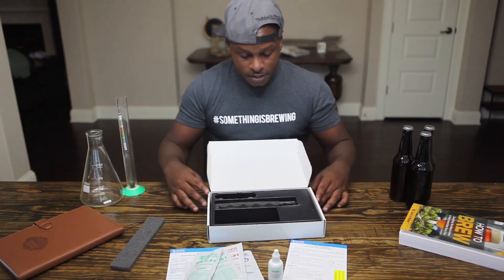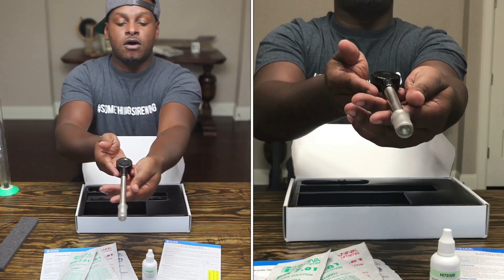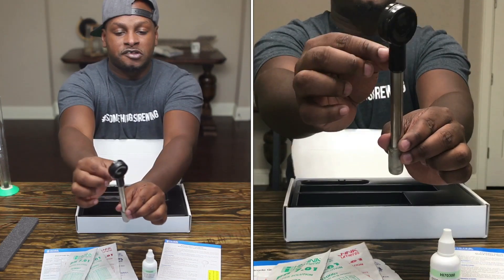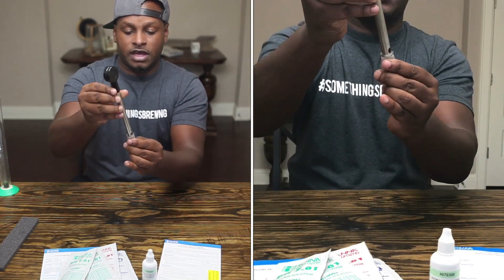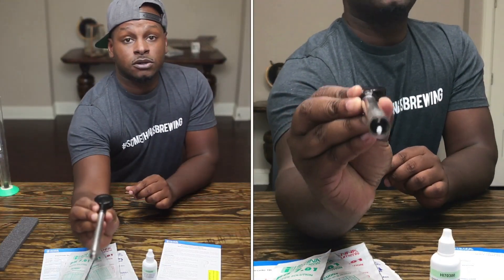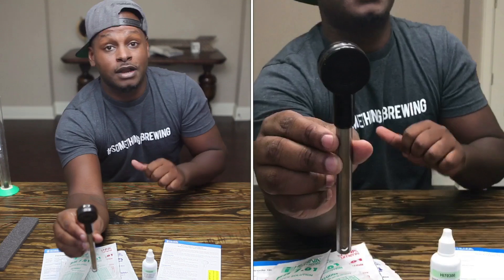Now let's get to the actual probe. When I first unboxed this I fell in love just because of the build. Very simple, very sleek, awesome design — titanium probe, all-glass electrode. You have the actual halo itself, which has a battery that is easily replaced — the same type you'd find in a basic watch. The storage case is all silicone and comes with a little storage solution inside. The electrode is all glass with a titanium body. It's not drop-proof, but I'm pretty sure it can withstand some damage. Very beautiful looking design.